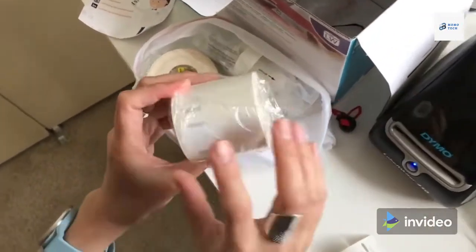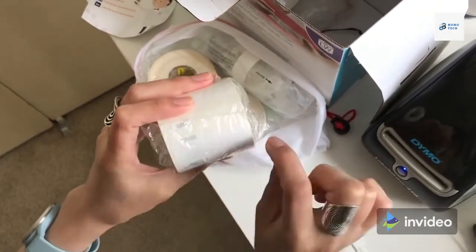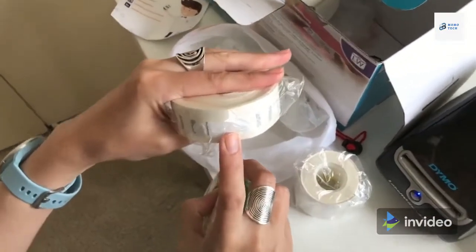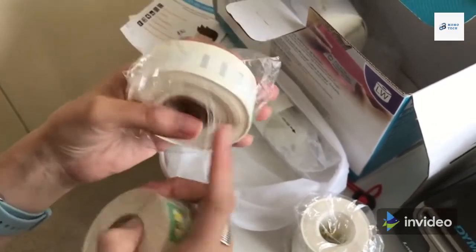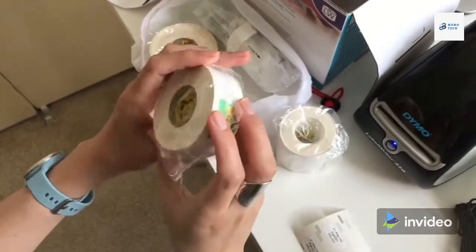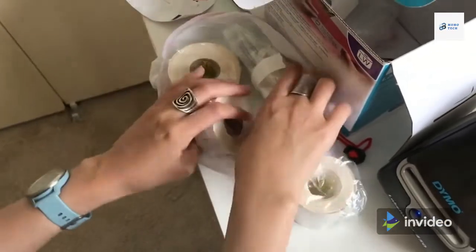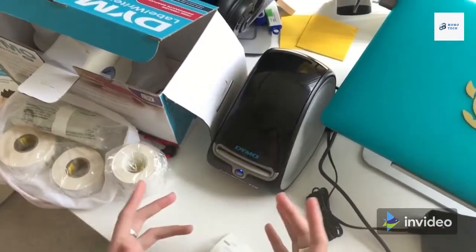For the lab, he got these ones that you can use in the multi-well plates, which is nice because they are really thin and suitable for that use. These ones are regular for tubes, so they are not intended for cryopreservation, just for 4 Celsius degrees, for something at room temperature, etc. Then you have this other set that is for cryopreservation, and it will work nicely for your boxes, so you can label the box inside and outside, and it will be easy because this one doesn't fall off. And the other ones are the cryopreservation ones that are already inside the DYMO for cryotubes.